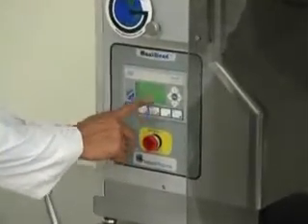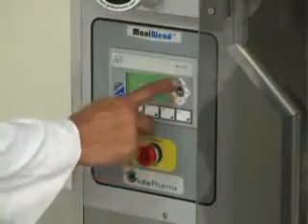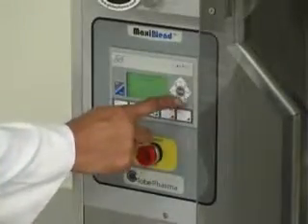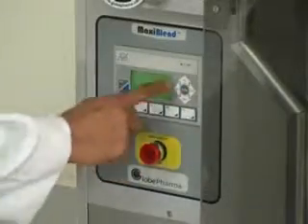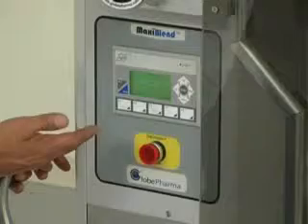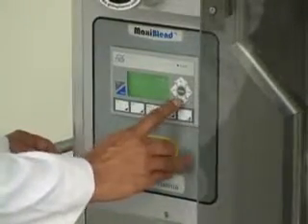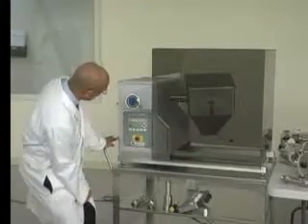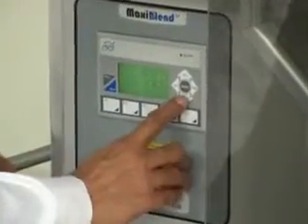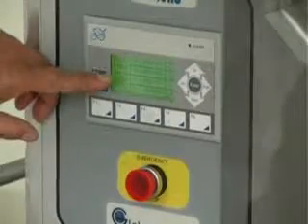This is the PLC control display. Here you have up, down, left, right scrolling. This is the opening screen which says GlobePharma MaxiBlend MB1 — press up or down to scroll. We press down and that shows different options, then press down again and it shows shell time and bar time.